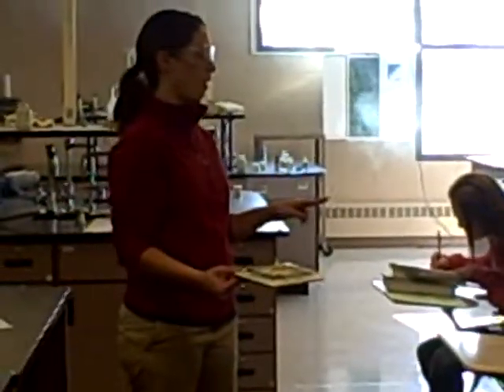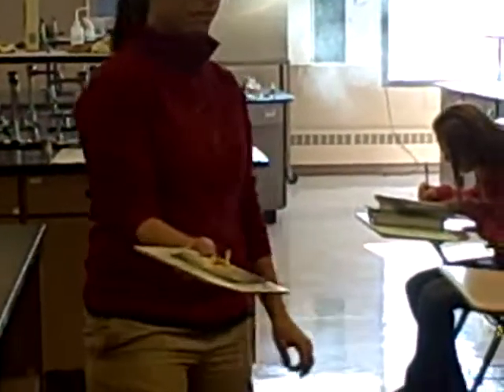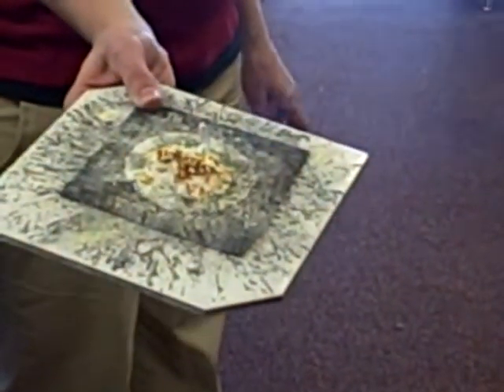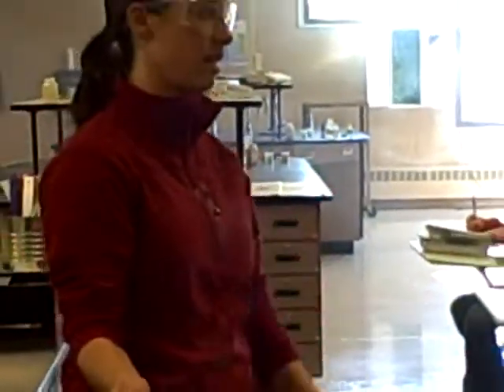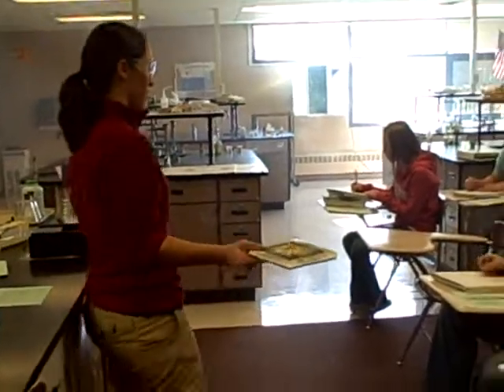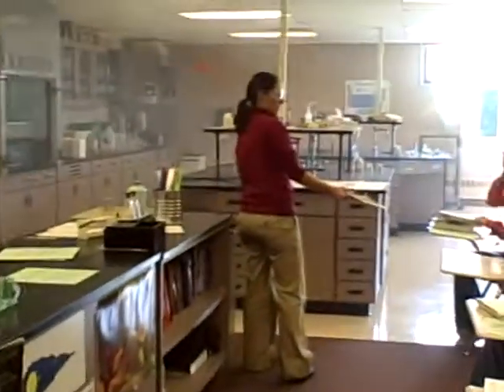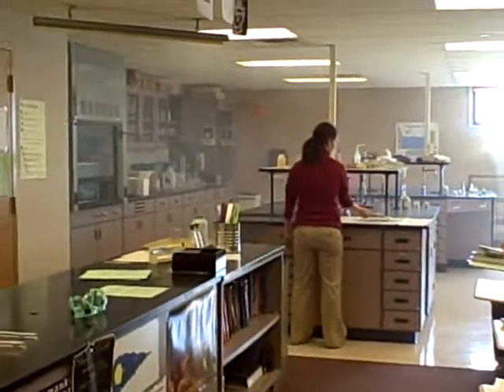Sulfur and zinc. Okay, look at what it looks like now. You should have observations of this. It's kind of white with yellow, orange stuff in it. Looks different. What state would you say this is? Solid, so write that down, because you're going to need that for your reaction. Yellow and orange in it. Yep. I'll leave it here, you can come look at it closely.